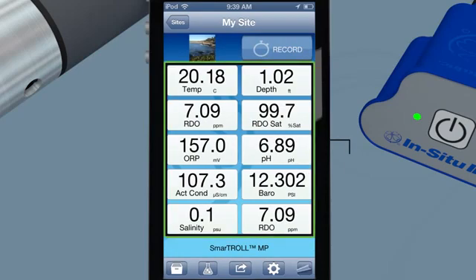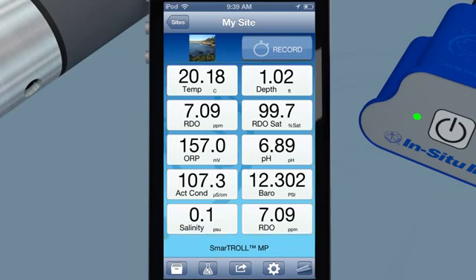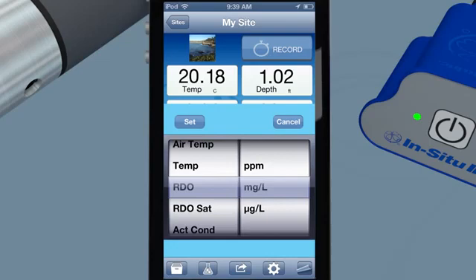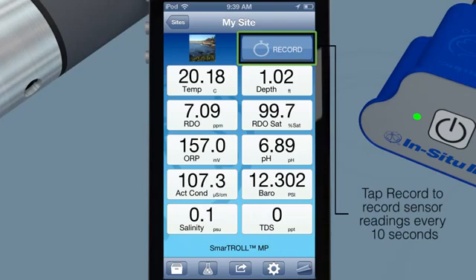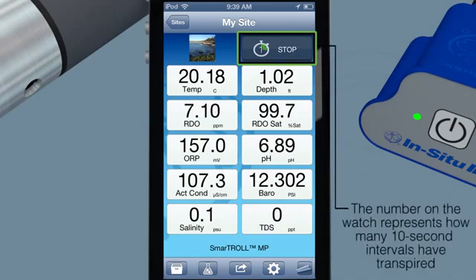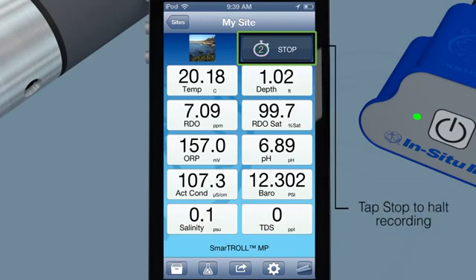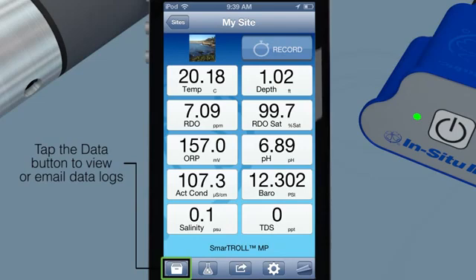View live readings for 10 parameters at a time. Easily change any parameter or parameter units with the flick of a finger. Record data in 10-second intervals with the tap of a button. On-screen indicators clearly display your measurement time. Data logs record all 14 available parameters. Stop logs at any time by tapping a button, and view previous data logs to compare your results.